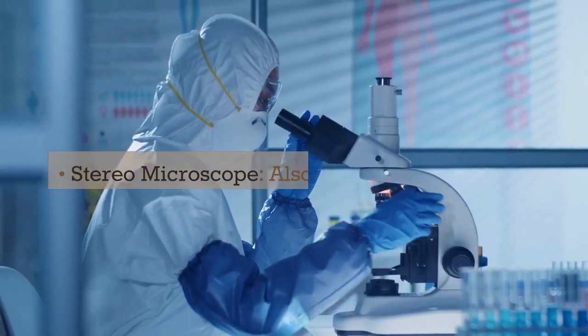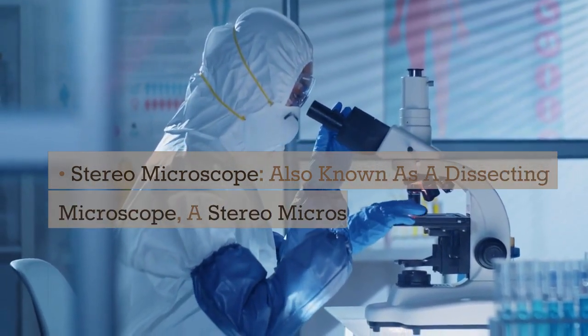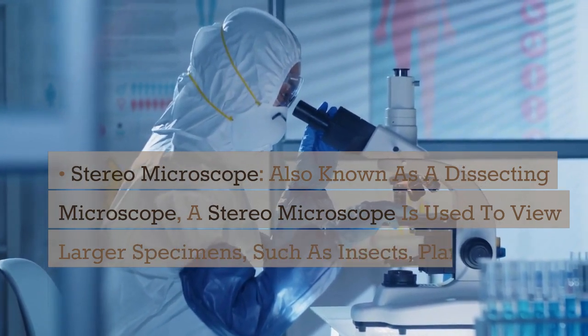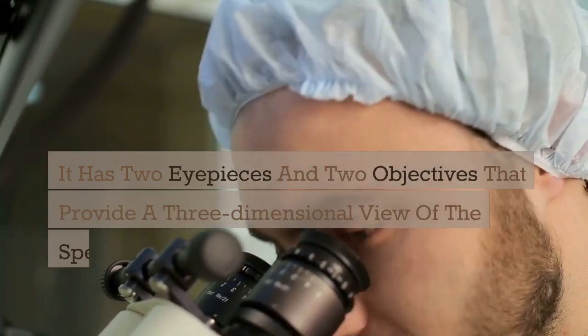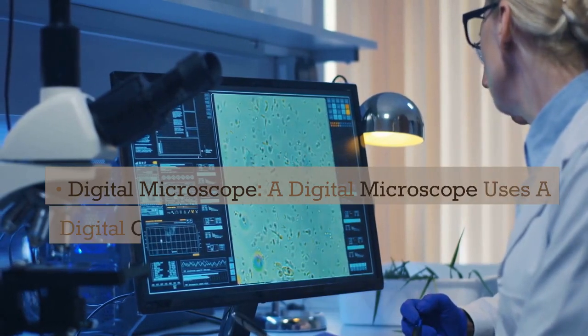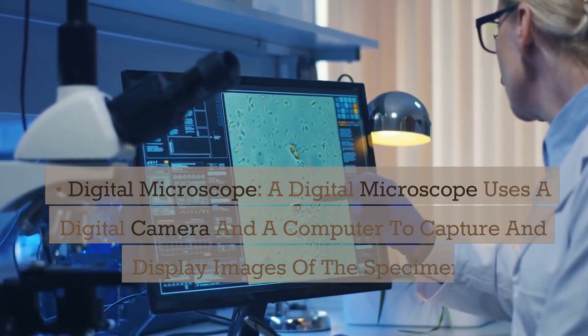Stereo microscope, also known as a dissecting microscope. A stereo microscope is used to view larger specimens, such as insects, plants, and rocks. It has 2 eyepieces and 2 objectives that provide a 3-dimensional view of the specimen. Digital microscope. A digital microscope uses a digital camera and a computer to capture and display images of the specimen.